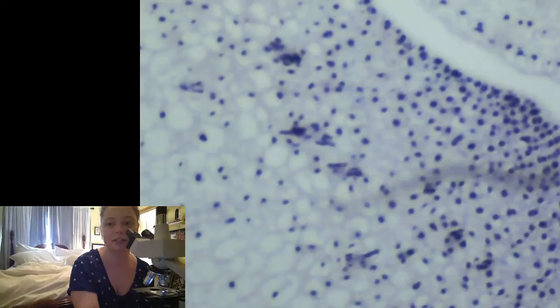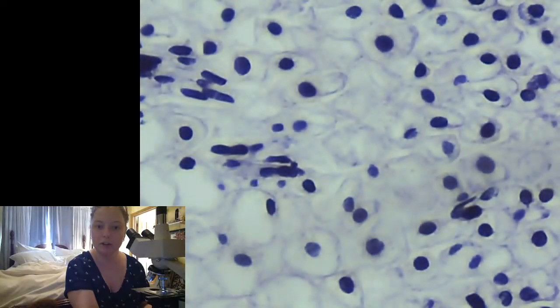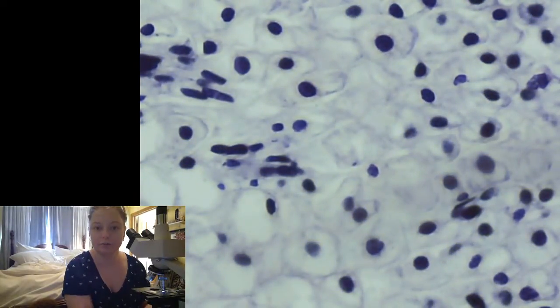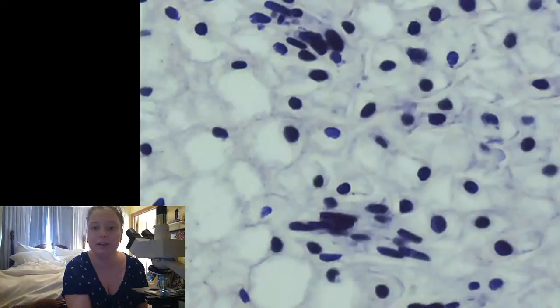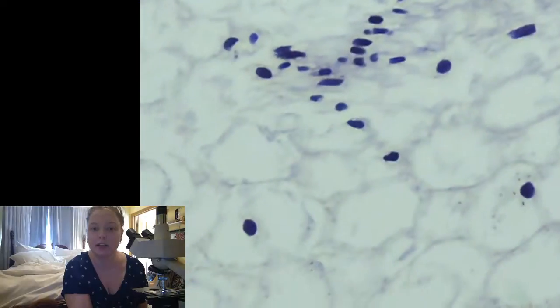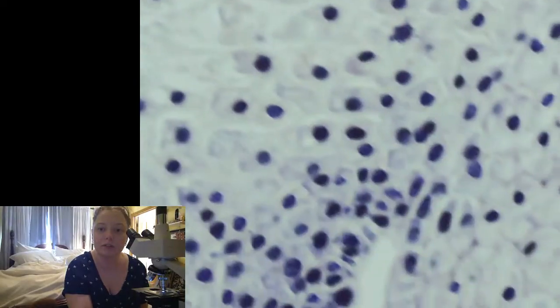Okay, so here we've got, these cells are doing meiosis, so they're going to look pretty similar to our mitosis slides. And we're going to see some of those chromosomes condensing. Zoom in a little more. So this slide's interesting. Even less so than the other one, you can't see those stages we talk about, but you can really see those condensed chromosomes. You can see them.